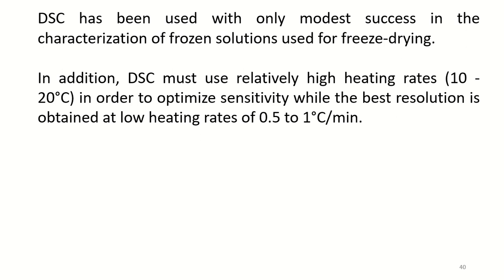In addition to this, differential scanning calorimetry must use relatively high heating rates, 10 to 20 degrees per minute, in order to optimize sensitivity, while the best resolution is obtained at low heating rates of 0.5 to 1 degree Celsius per minute.